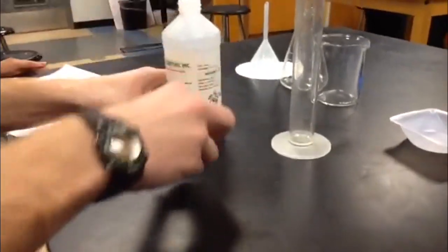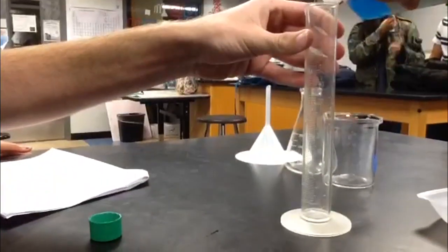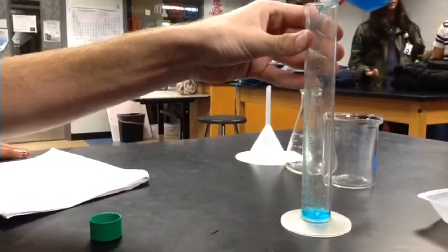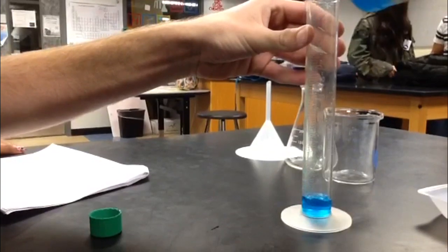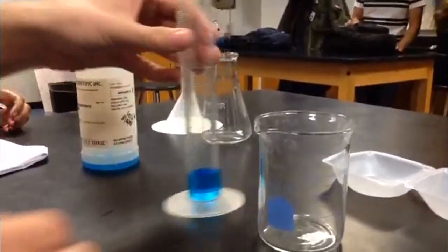Get the copper sulfate from the bottle and pour 25 milliliters of it into the graduated cylinder. Once that is completed, make sure it is 25 milliliters and pour it into the beaker.